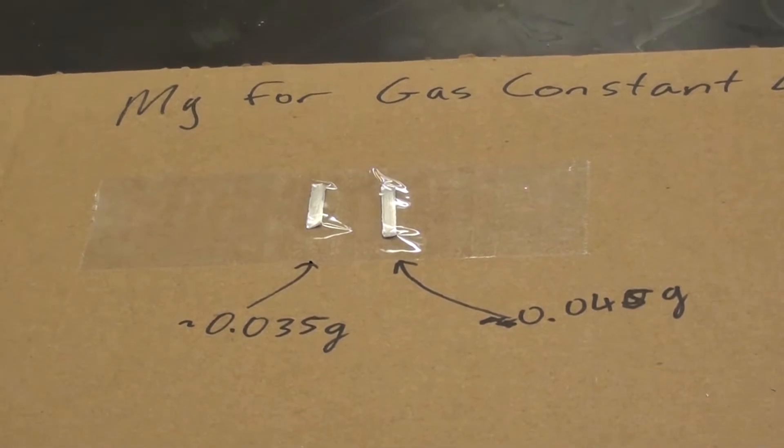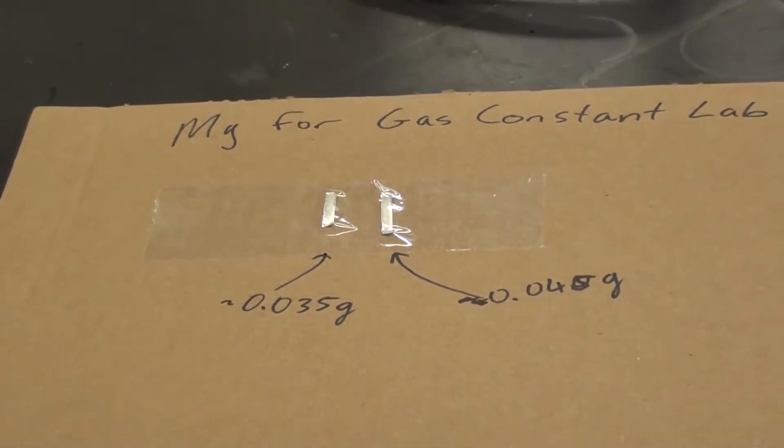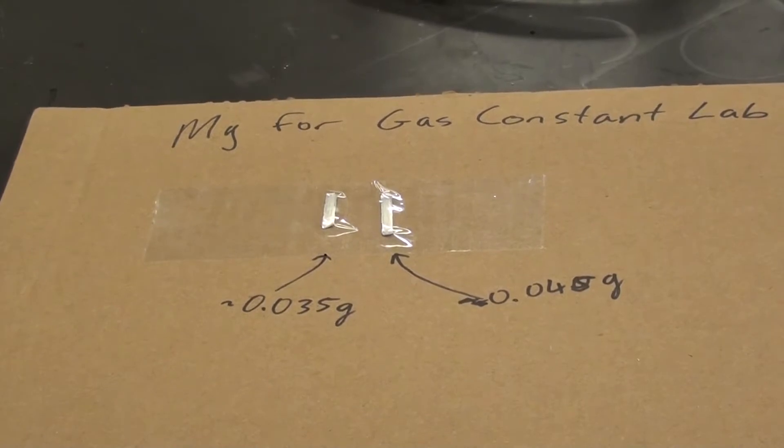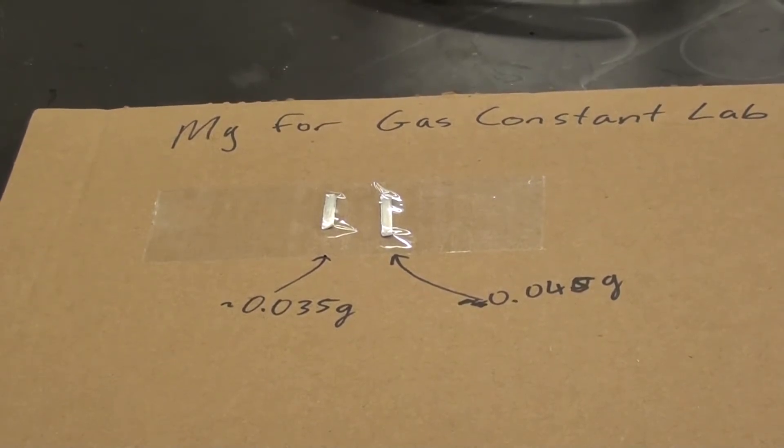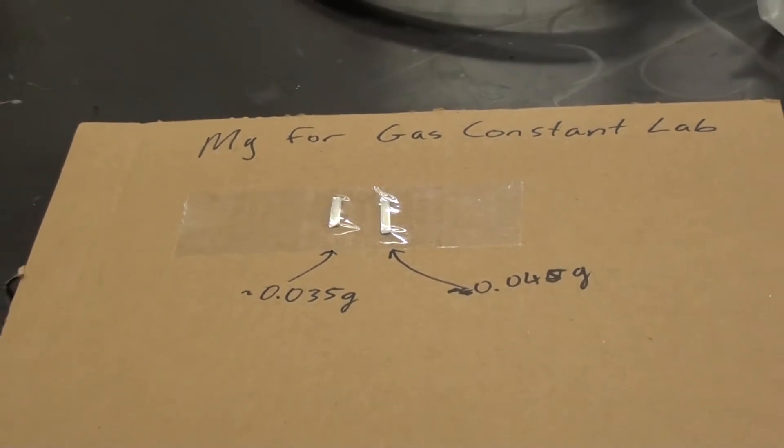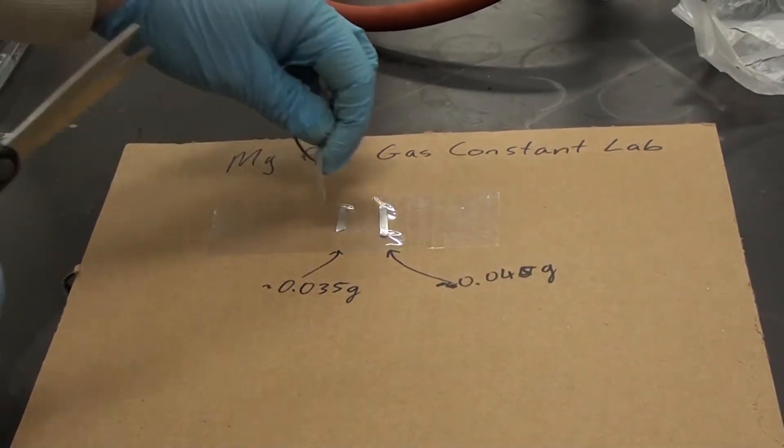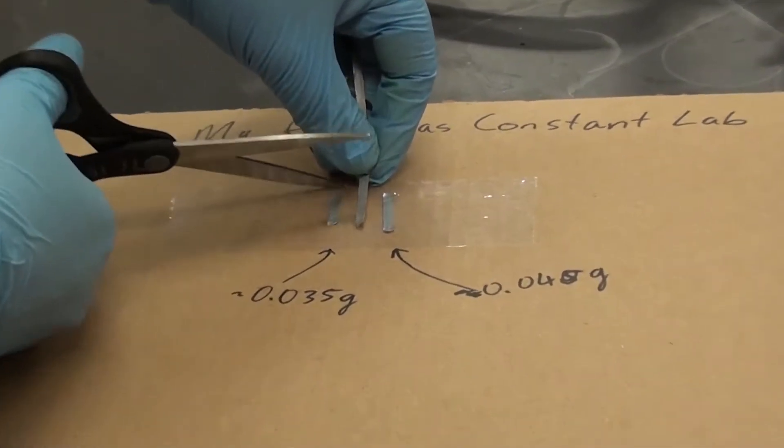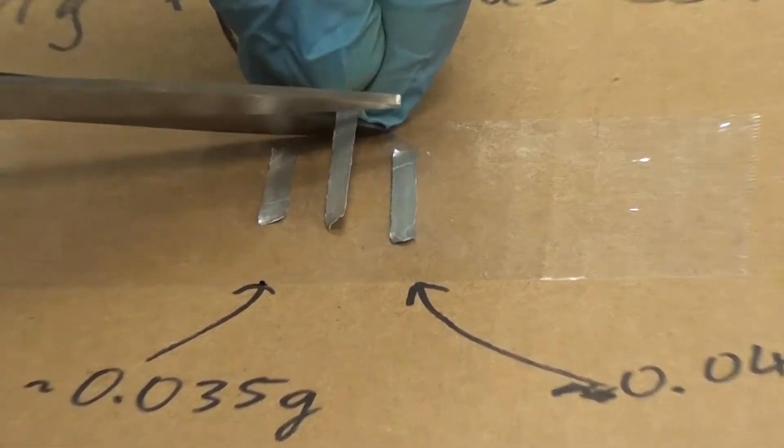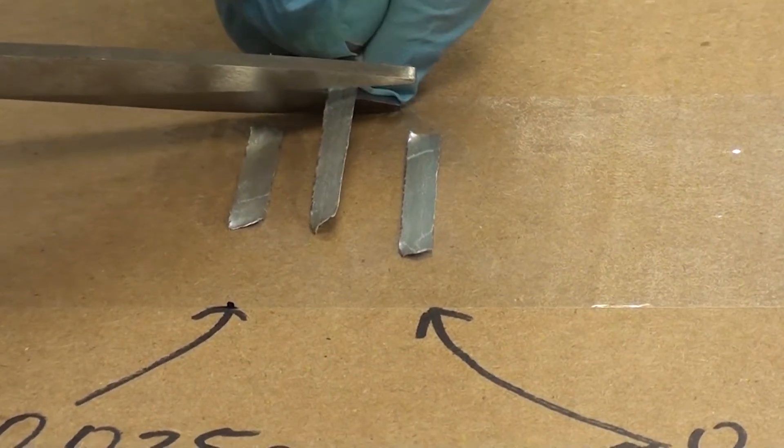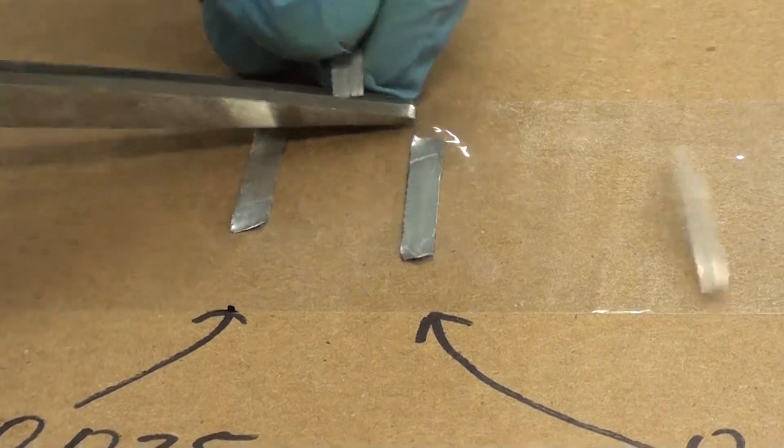Ideally somewhere in the 0.040 gram region. So I'm going to cut off a piece of magnesium that is about that length. I will use scissors here. You could just tear it with your fingers, but I think it's a bit easier or a bit more accurate using scissors. So I'm just going to cut a piece and hopefully it will be, whoops there we go.